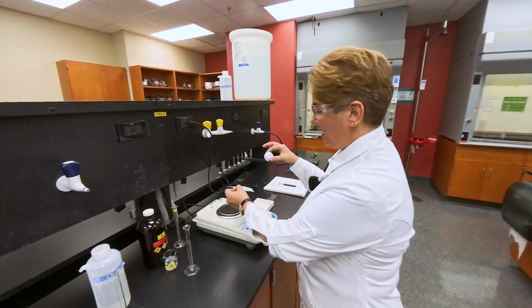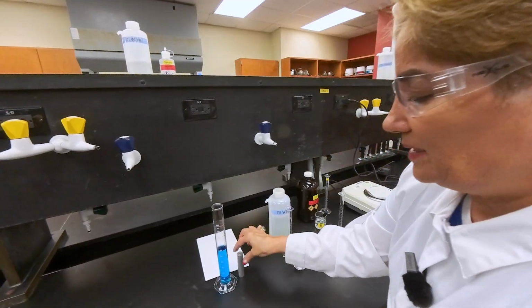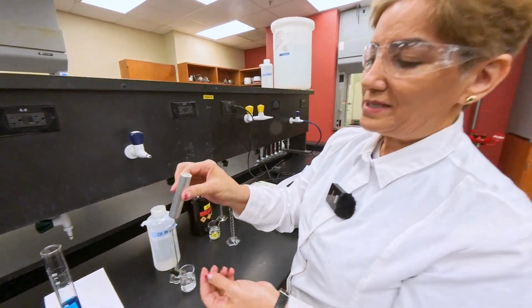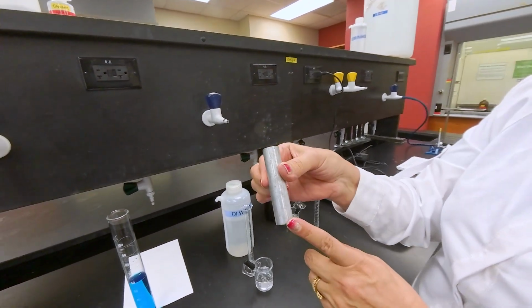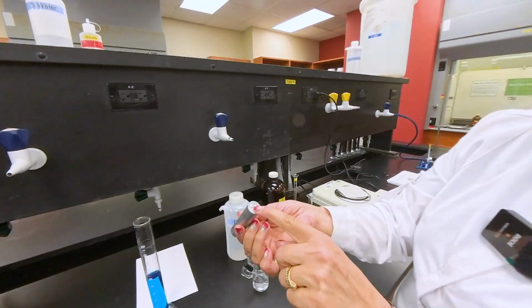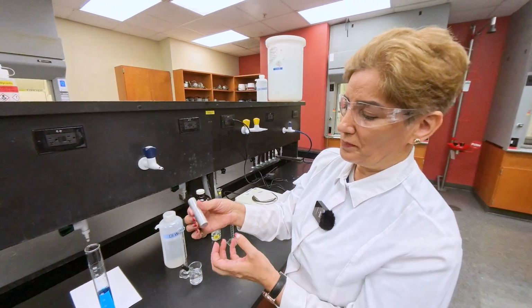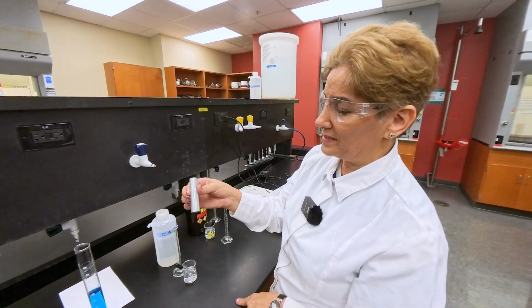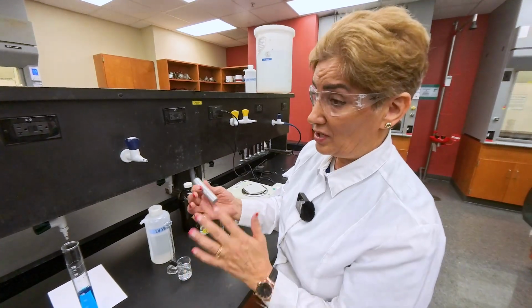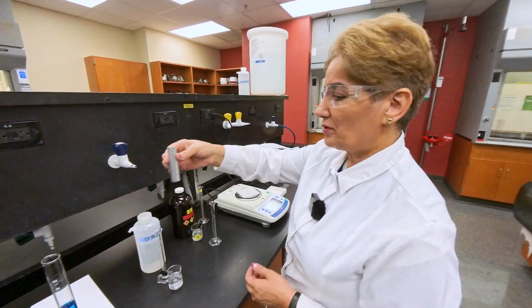Now, the next object that we have is a cylinder, and let's consider this as an irregularly shaped object. It's a solid. I need the mass and I need the volume again. Because it has this little hole in here, I have to make sure that the volume is recorded perfectly, so I cannot use dimensions in this case. And I want to teach the technique. If the object is irregular in shape, if you have a piece of rock, how would you measure the volume? So we are going to measure the mass.